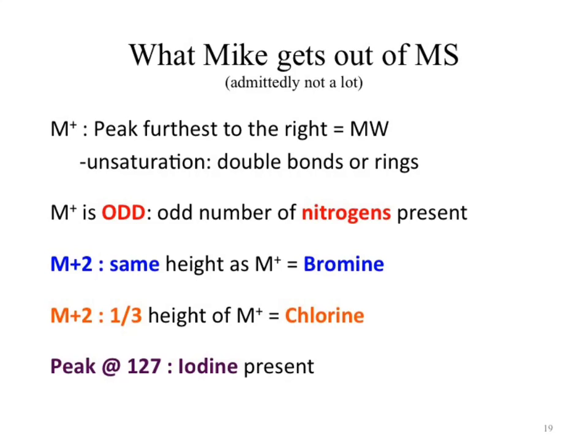When you average that, you then get the molecular weight that's shown on your periodic table, which is 79.9, roughly the average of 79 and 81. Because there are those 2 common isotopes, in a random collection of our sample or our molecule, if bromine is present, we see those 2 peaks being relatively the same height.